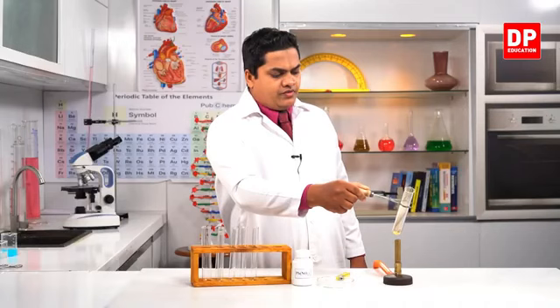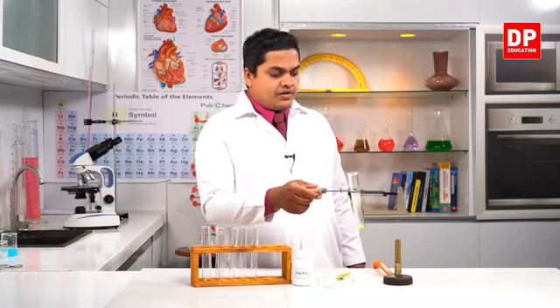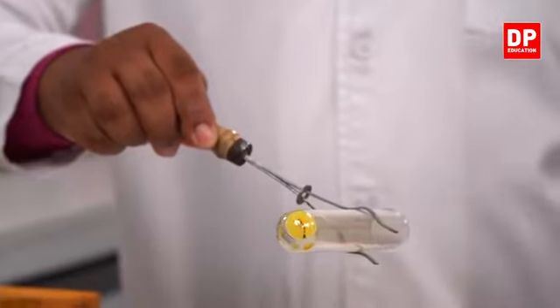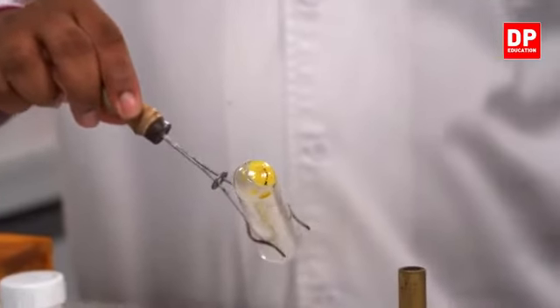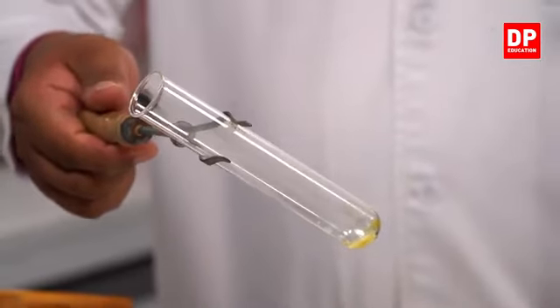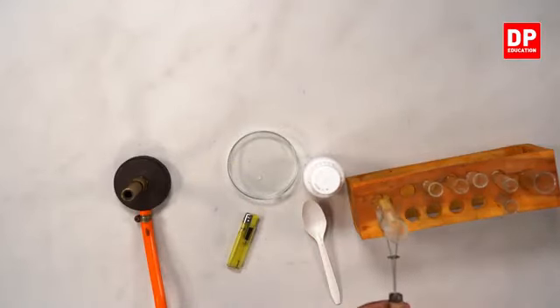Right, you can observe now there is a brownish color gas, and when we see the residue, it is somewhat brownish color also, you can observe, like in the earlier case. Now once again I'll keep it in here.